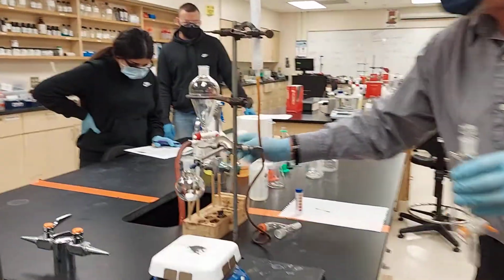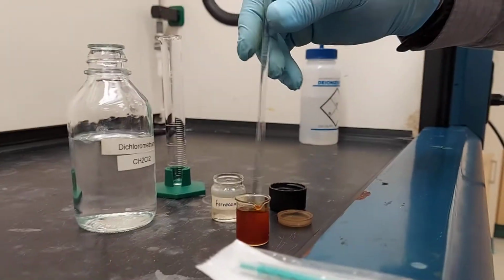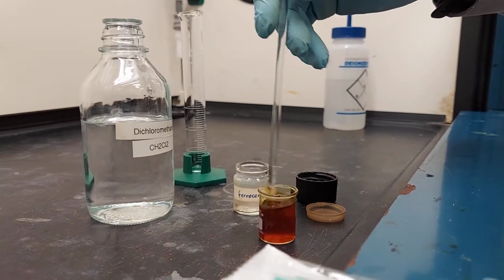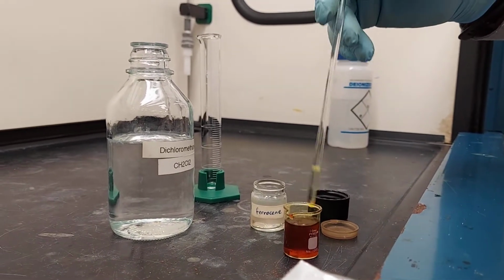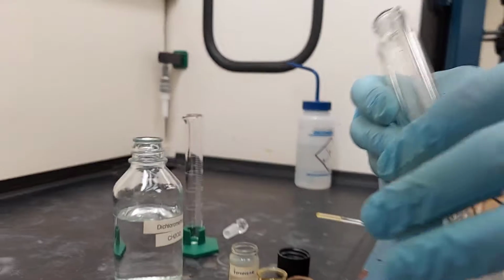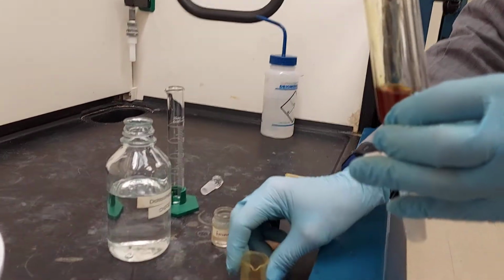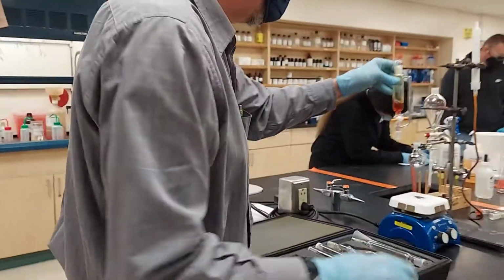And I need a stir rod to homogenize my solution. I notice I spilled a little. We're homogenizing our ferrocene solution. Burgundy color. Get the lid off here. When we're pouring in here, we've got to make sure we don't pour over the air equilibration arm. And there's our ferrocene, which we'll add slowly to our reaction mixture when we need to.